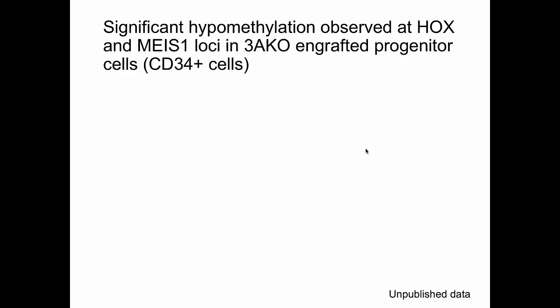It's not that it's replacing or going to replace mouse genetics, but it's a supplement or an alternative to some mouse genetics approaches in which you can actually work with human hematopoietic cord stem cells and begin to explore molecular and cellular phenotypes following engraftment. And these are some in vivo phenotypes.